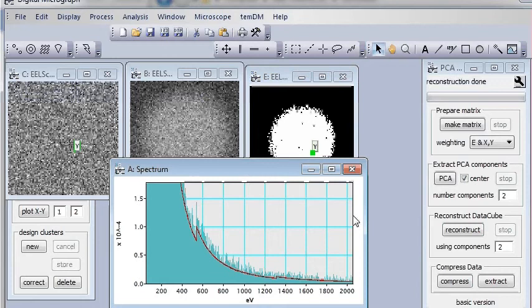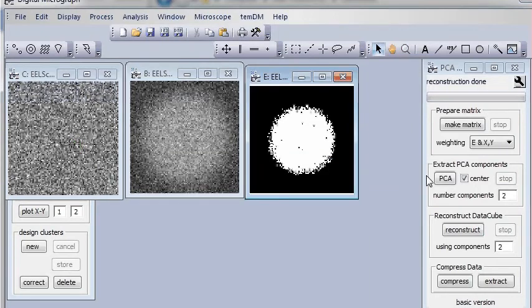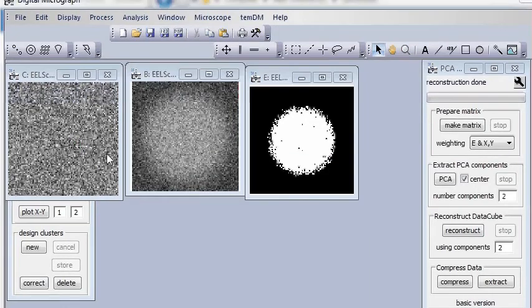Good. So let's stop this twin viewing just by closing the display without saving. Now I would suggest to save all changes in our MSA matrix, because we did a lot of job with clustering, and all the steps are currently inside this matrix, but it's still not saved.